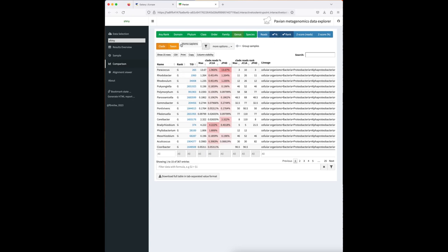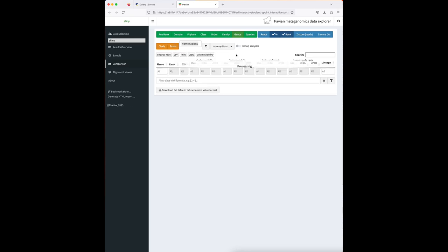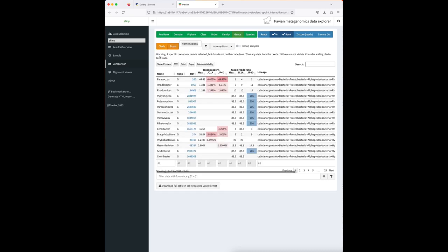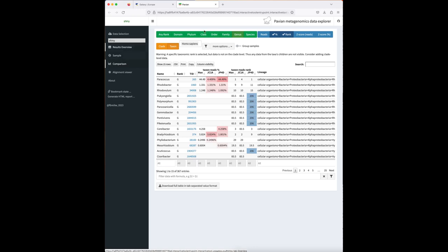According to the paper's authors, this correlates with a specific genomic trait enabling Alphaproteobacteria to cope better with high nutrient availability. Pavian allows exploration at different taxonomy levels — taxon vs. clade — and offers many analysis options.